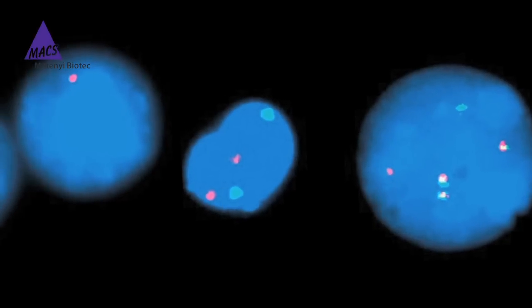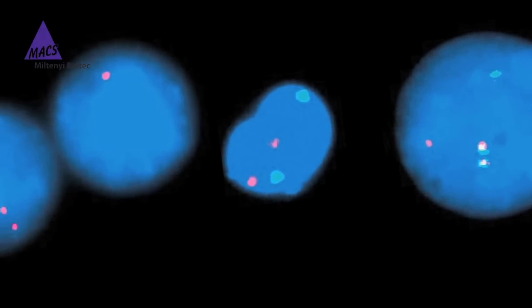This technology has been applied very successfully by many labs worldwide. The purified cells can immediately be used for numerous downstream applications, including quantitative PCR and SNP arrays for HLA and chimerism analysis, or for FISH analysis in multiple myeloma studies.